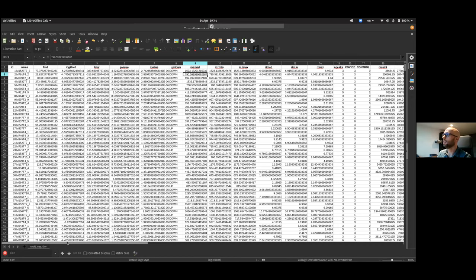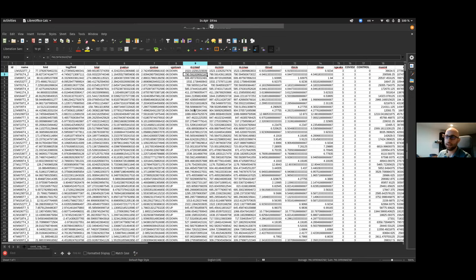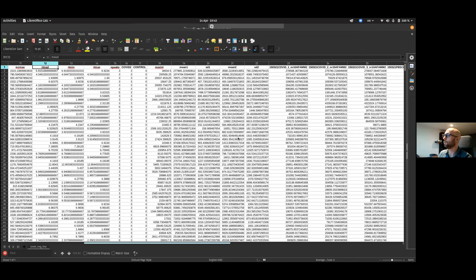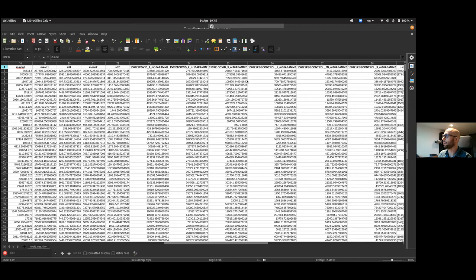The most important thing you need to know from these files is the name of the mass column, which in this case is MZMed. That's how it usually goes in XCMS. Then the retention time and the units of the retention time, in this case minutes, and the number of the column where we get the first data, in this case number 23. Furthermore, in this example we have three samples. So it's one sample with three technical replicates, that's it. And then we have three solvents here, and that's all the information we need.